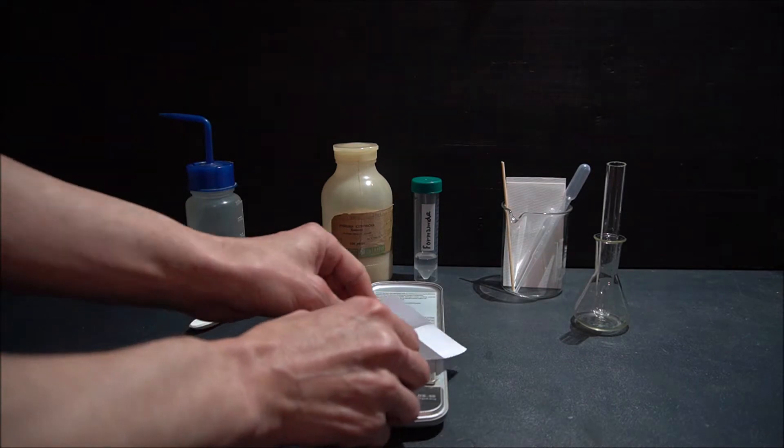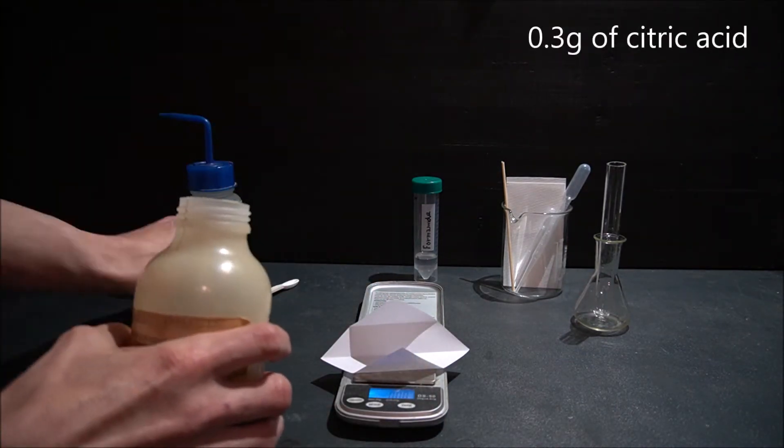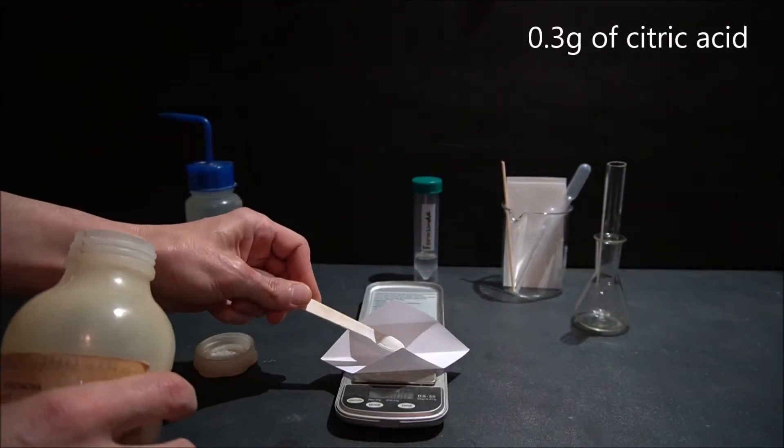First, weigh out about 0.3 grams of citric acid and put it in a glass test tube.